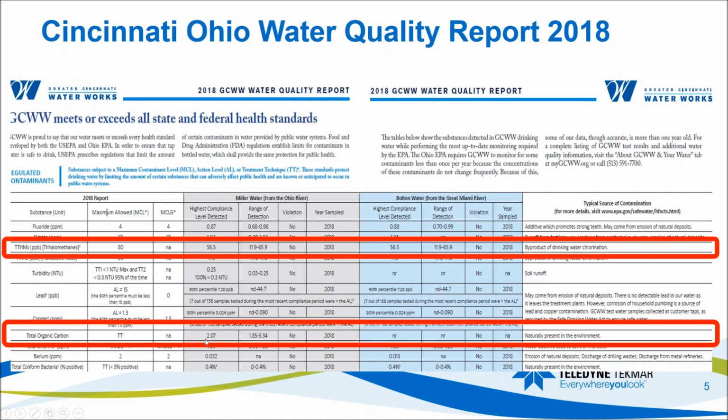So the water we drink here in Mason, Ohio is about 2 parts per million, was the highest that they recorded. This is done by state regulations. For example, I know Ohio and Kentucky require TOC content reported publicly like this, while Michigan does not. So you might have to check with your local area, state, or country on if it's required or not.